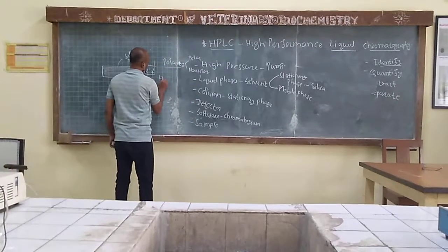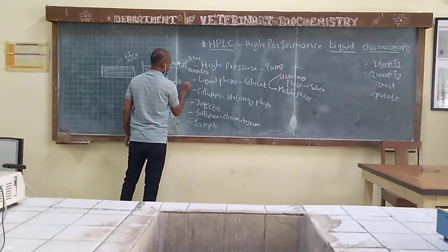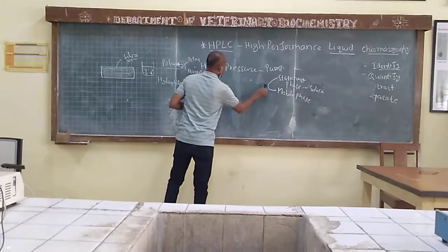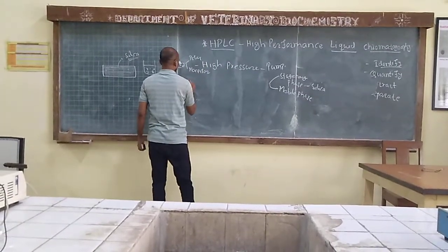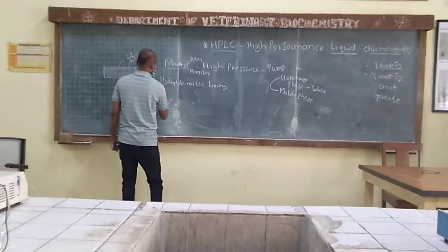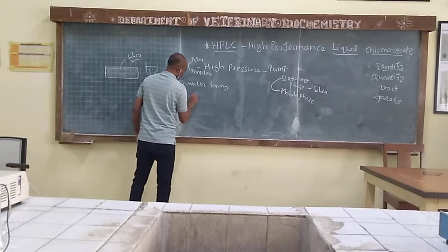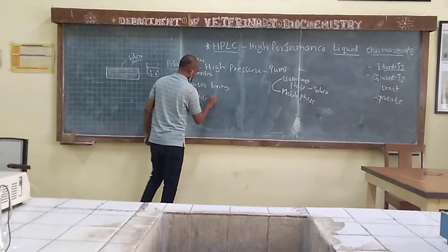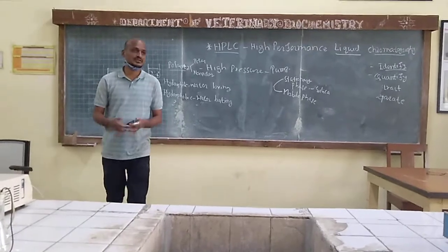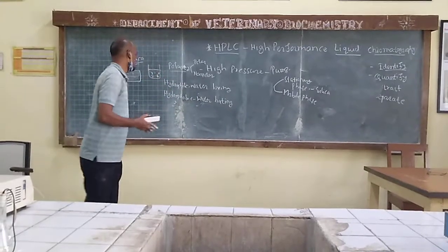When we say hydrophilic, water loving, and hydrophobic, water hating. These are two things. Water loving molecules are there, water hating molecules are there. So this is one criteria.